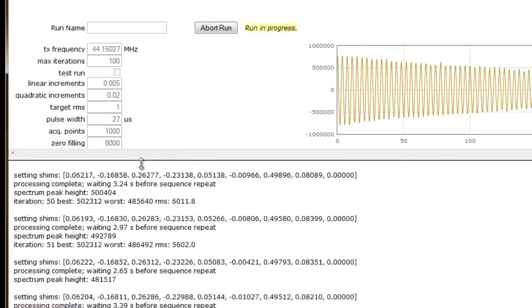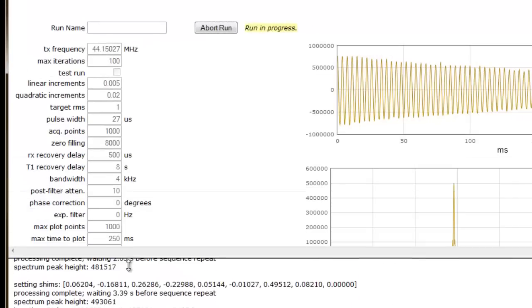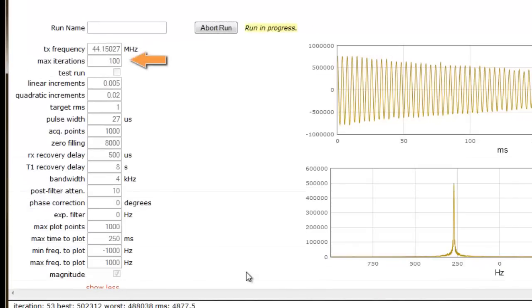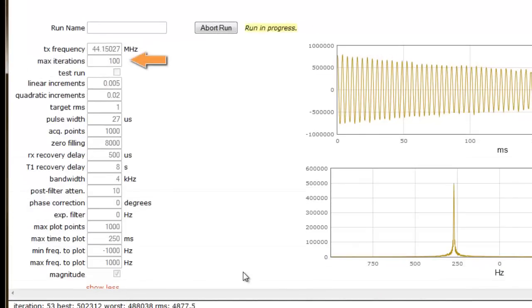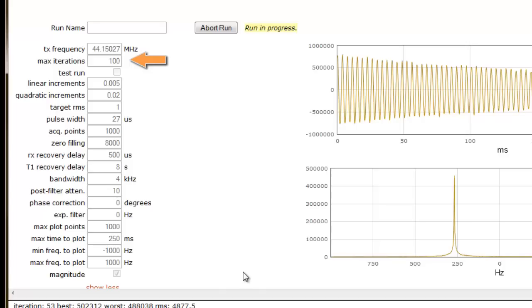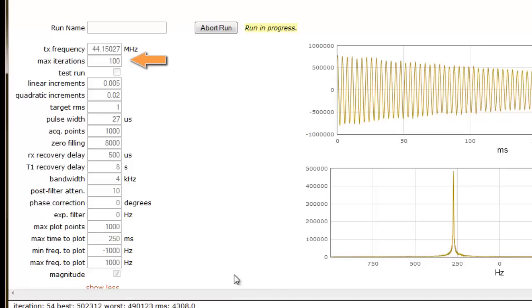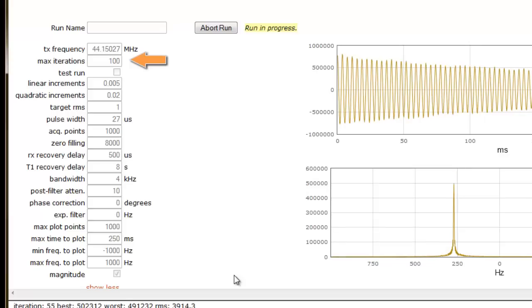When shimming, it is advised to set the maximum number of iterations to 100 and to allow the AutoShim script to run to completion. While aborting the AutoShim script early has its advantages, such as when the best possible optimized shim has already been achieved prior to reaching the maximum number of iterations, one runs a risk in aborting the script too early. It is to your advantage to allow the AutoShim script to run to completion.